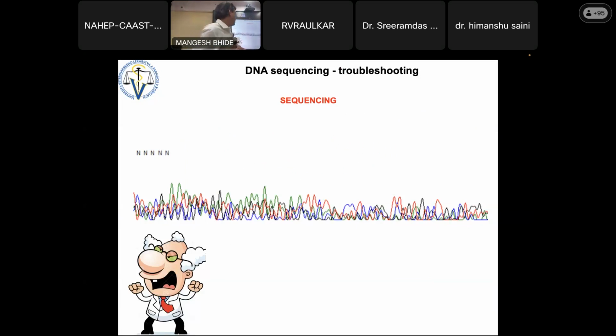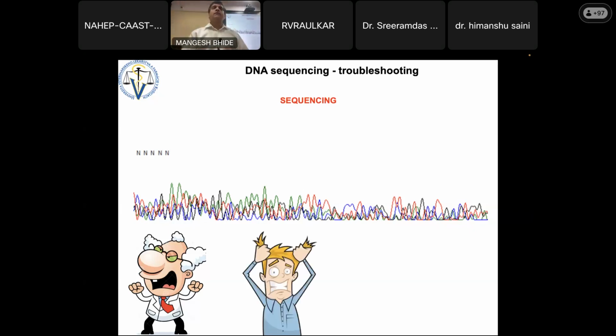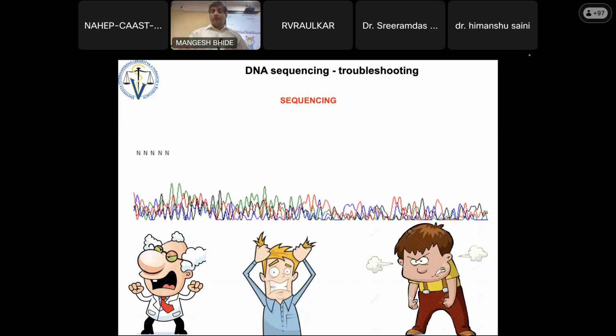You should not have this kind of result, but often when you send samples for sequencing, you get this kind of result. So today we are going to see why we get this kind of result and how to avoid that. But before, we will go through the basics of how it works, and then you will identify how to avoid these problems. The first time you will get this, the second time you will have this kind of reaction, the third time you have this kind of reaction, and you don't know what to do to avoid your bad results.